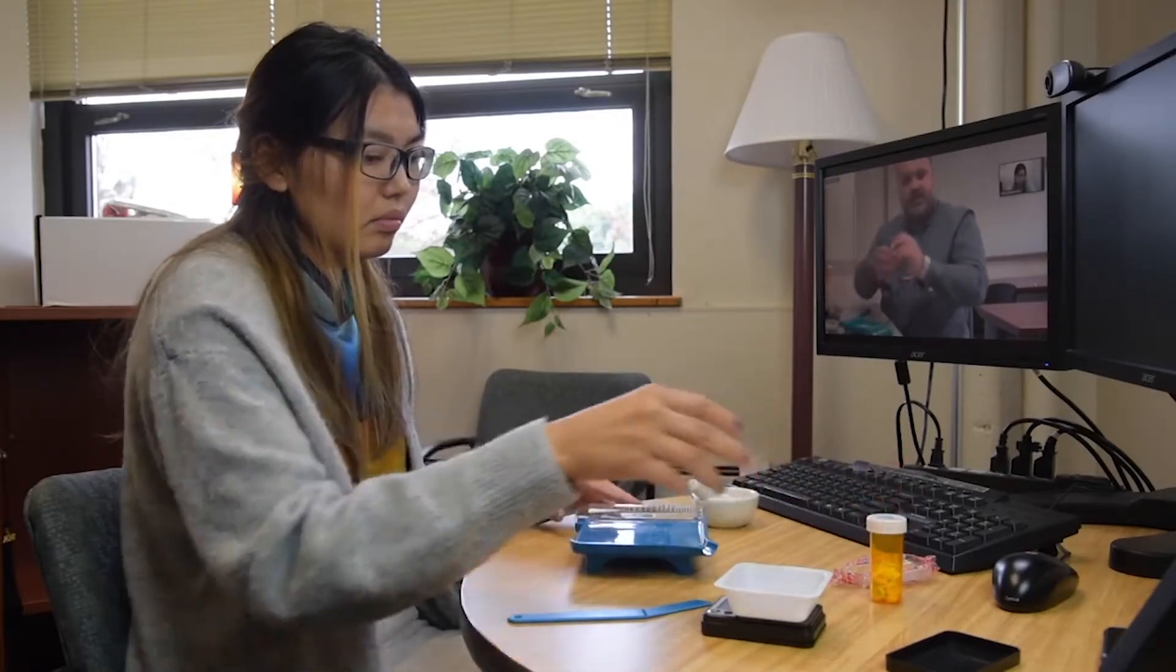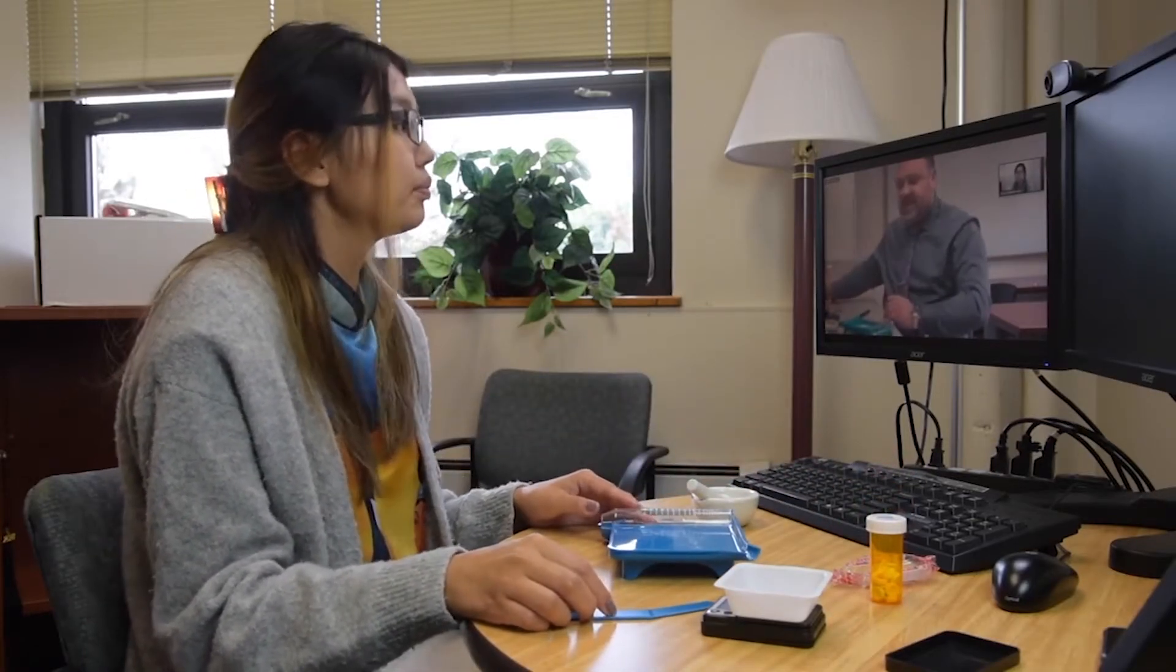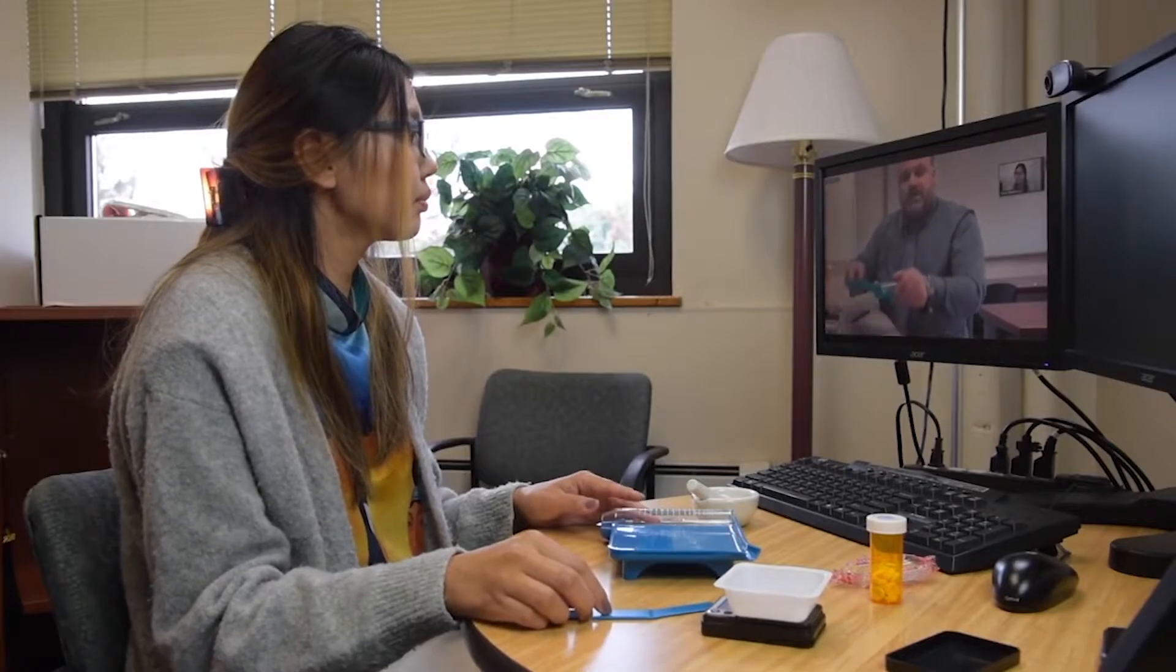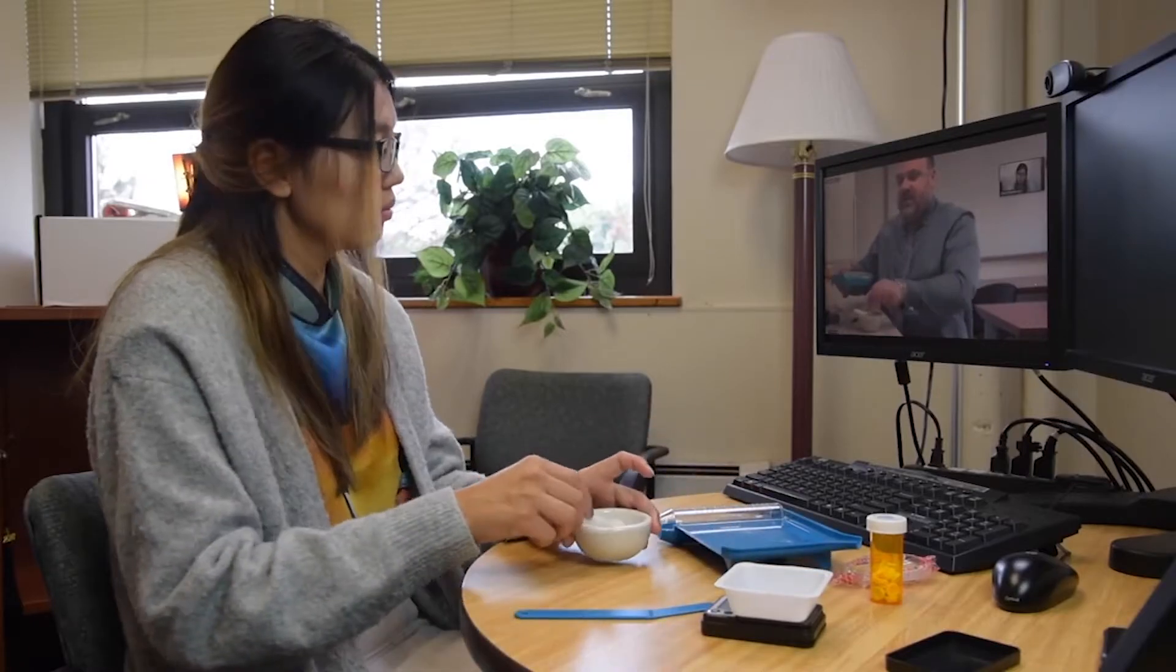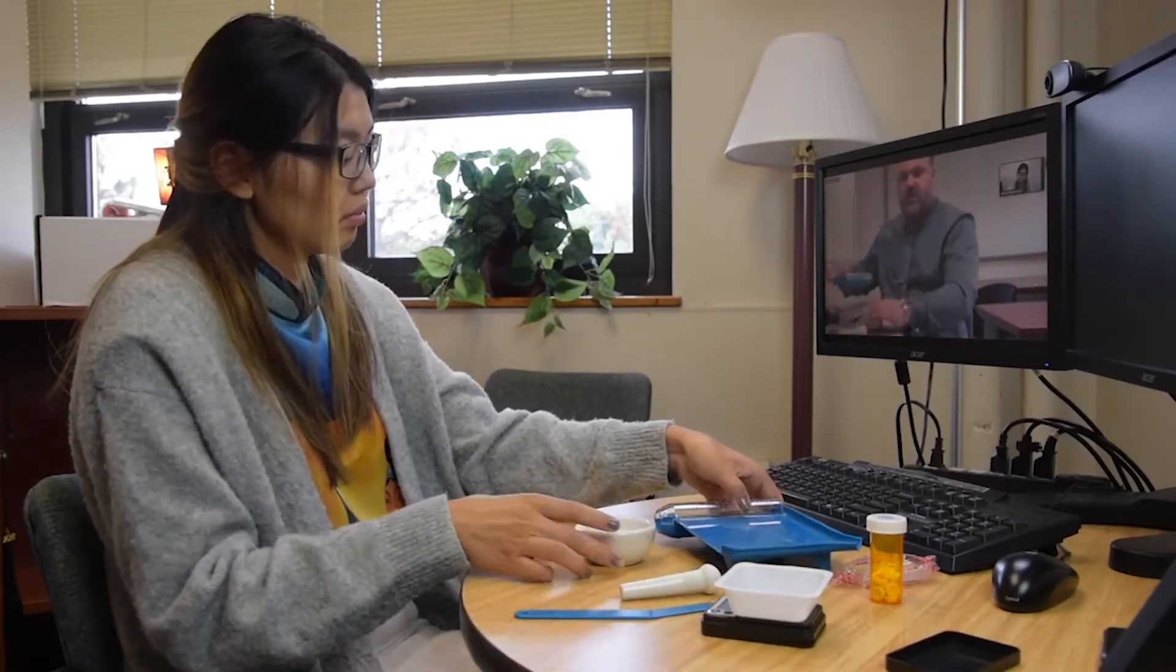And then go ahead and set your prescription vial with the extras off to the side. Take the five that you counted out and then you're going to place them into your mortar.